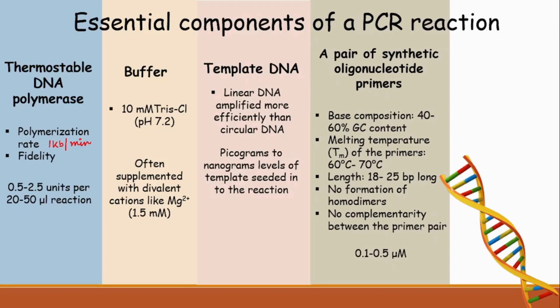And the second mode of complementarity is between the two primers, that is between the forward primer and the reverse primer. If the forward primer and reverse primer anneal to themselves, it would form a heterodimer duplex, which is again extremely stable and again prevents the primer from binding to the template DNA. So normally there are several computational tools which help in determining the efficacy of a primer. An example of such a tool is OligoAnalyzer, which is maintained by IDT. So you can have a look into the website.